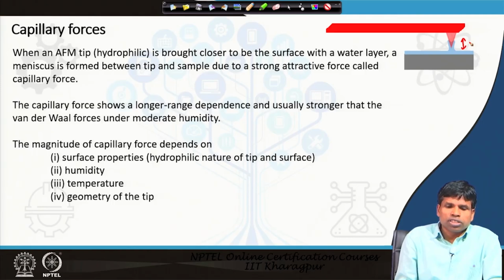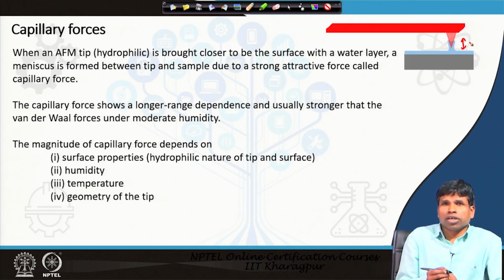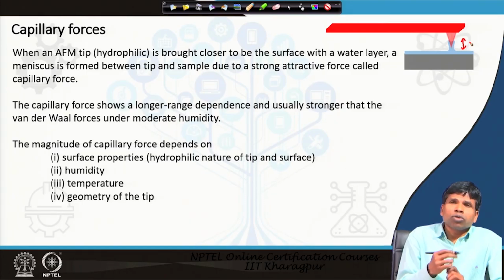This capillary force is a long range force, and it is stronger than van der Waals forces. Therefore, on many occasions this capillary force will mask the other properties of the sample surface. Thus, when we are doing atomic force microscopy under ambient conditions, this capillary force will also come into the picture. We will not be able to measure the van der Waals force.